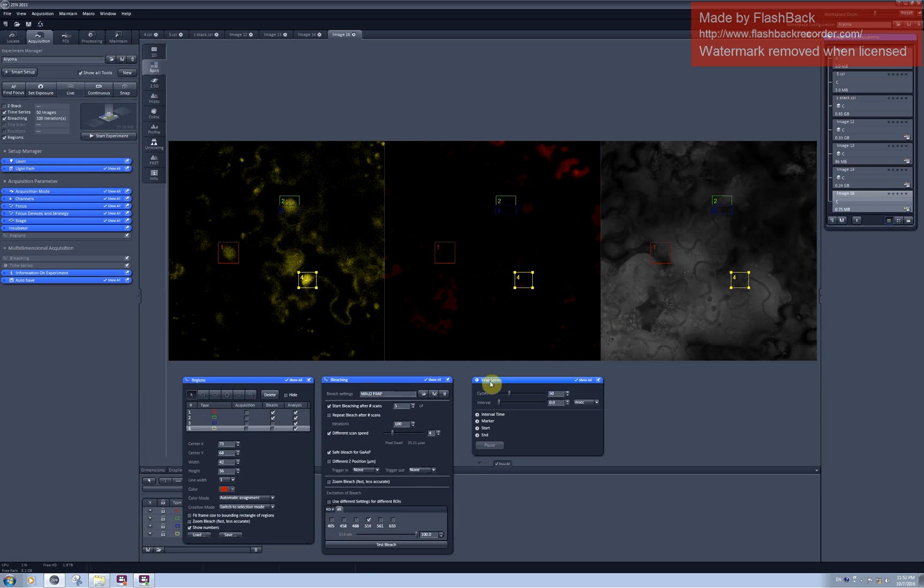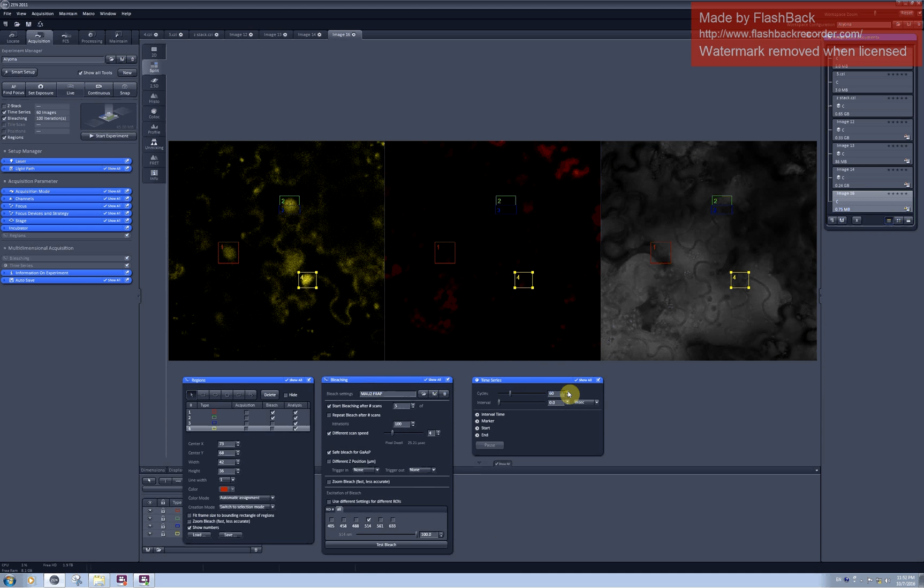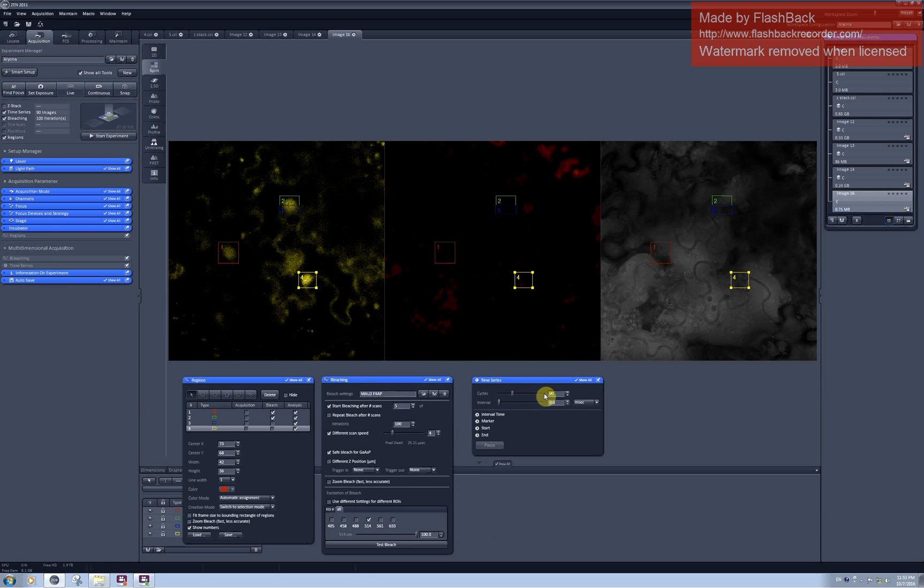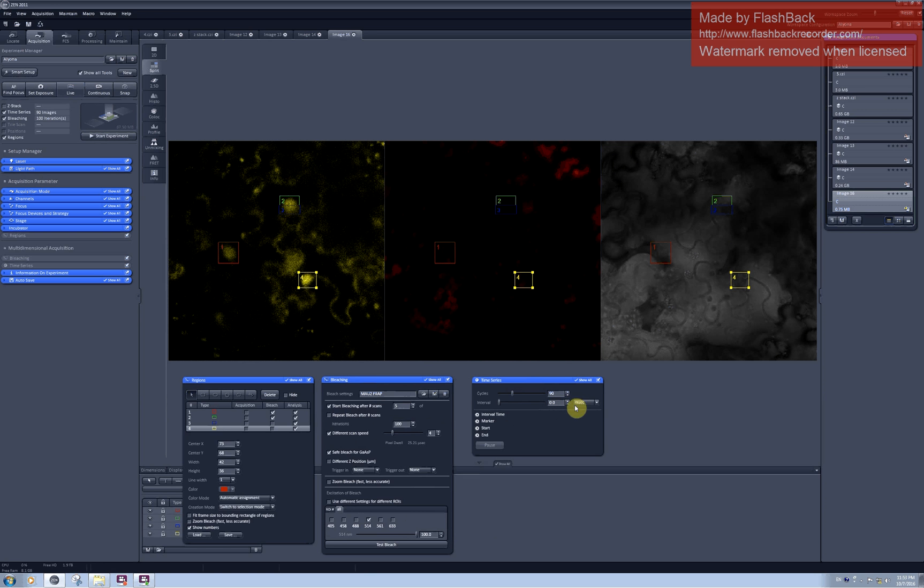In the time series you can set how many scans would you like to perform after photobleaching. Again this you need to estimate empirically. It will depend on how fast does your protein move. Sometimes you will need to scan for several minutes, sometimes for maybe 15 minutes or 20 minutes. I will set currently on 90 scans with no time interval in between. So this will be continuous scanning. And after I set all these parameters I can click on start experiment.